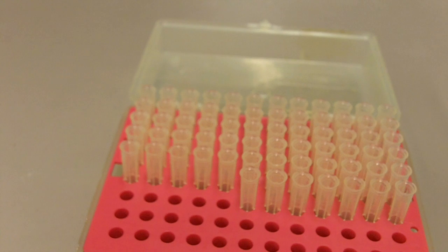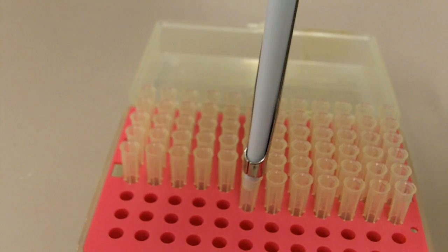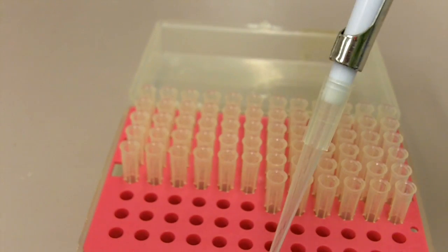That's how the ejector works. Now I'm going to show you how to put on a tip properly without damaging the pipette. You should just press down the pipette and twist. And now you have the tip.